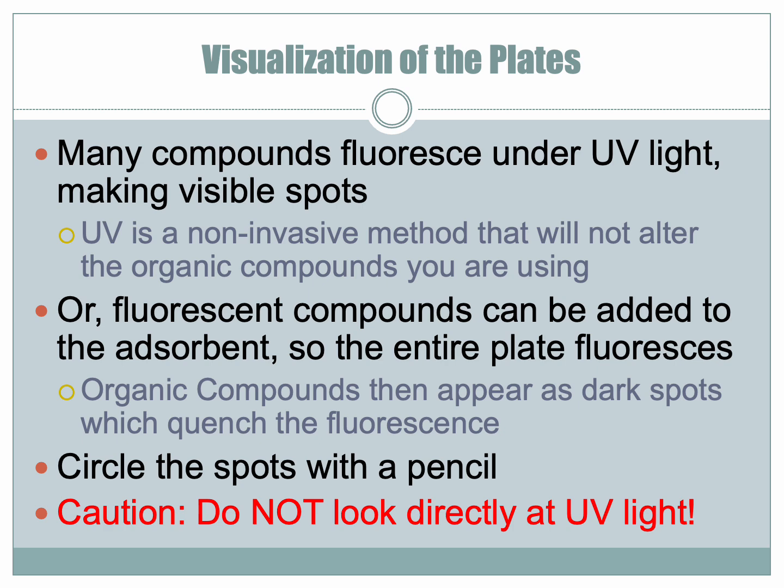Many compounds fluoresce under UV light, making visible spots. So this is what I was saying before, that some compounds fluoresce and you'll see a fluorescent color, like blue. The plate itself, if we illuminate the clean plate without anything on it, fluoresces bright green.